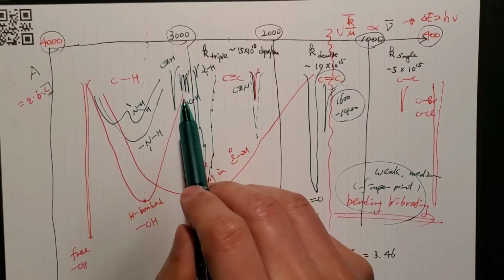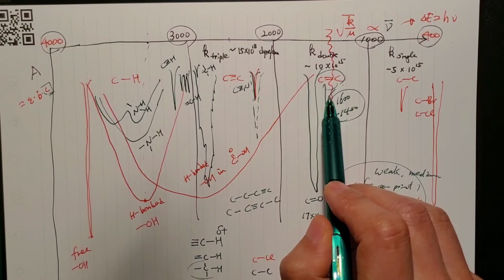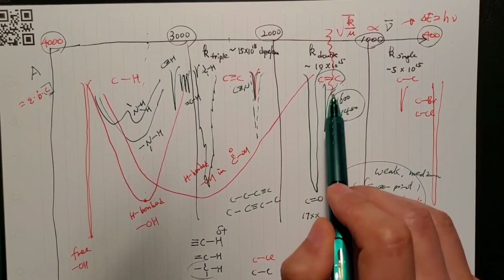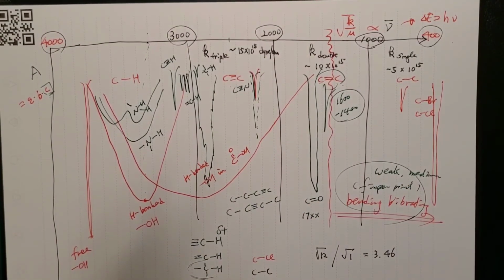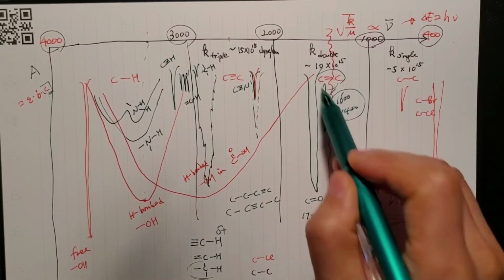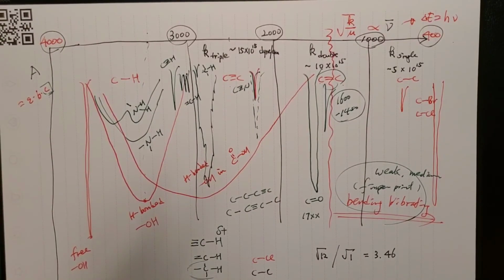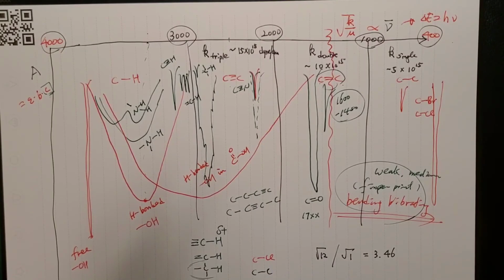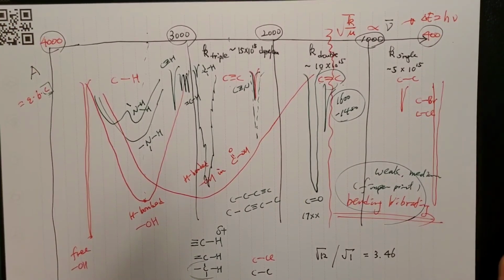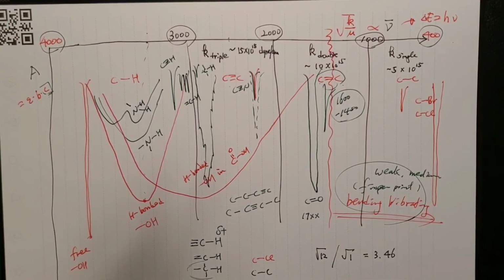So if you see any peak here, and you have something you are suspicious about, then you can say, yeah, I have this. If you have a chance to run NMR, then you want to double check with NMR, because NMR shows this more clearly. That's when you learn other techniques and you already see how reading the spectrum is going to be. You cannot rely on one. In order to have some confidence in your interpretation, you have to connect with the other spectra.